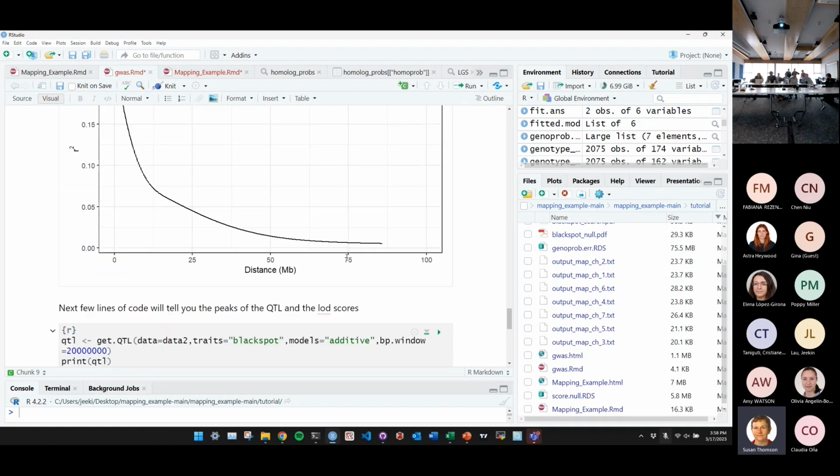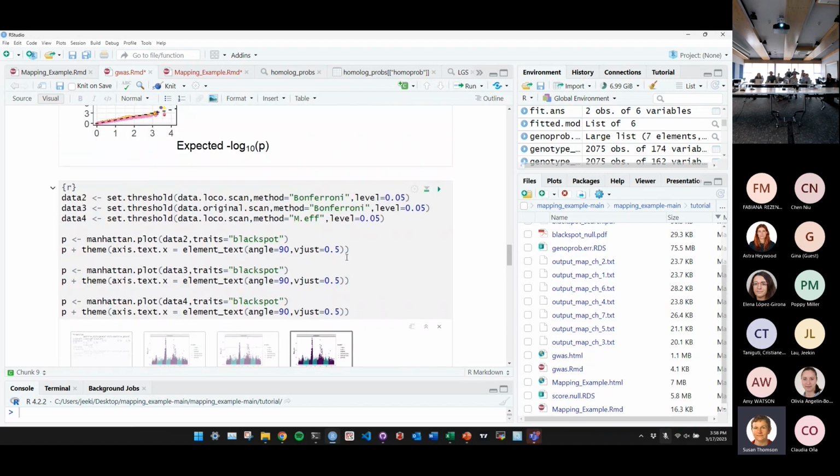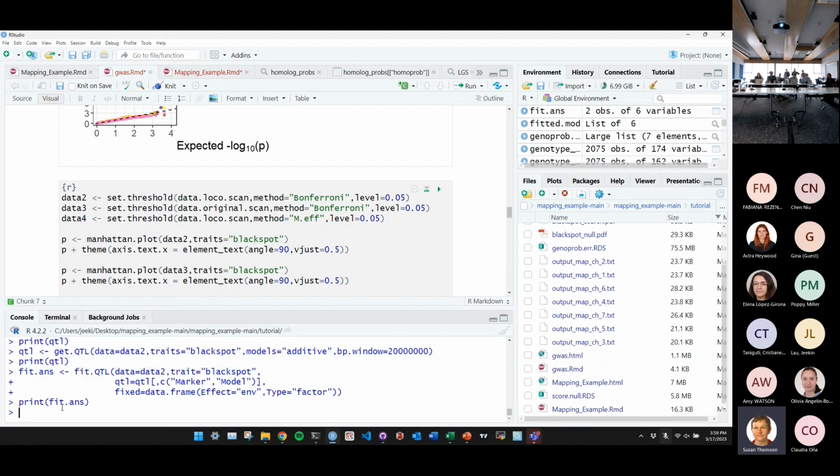So you need to save this, save for the thing that Chris needs. Save data for. So down here, type save, and then data for, comma, file equals.